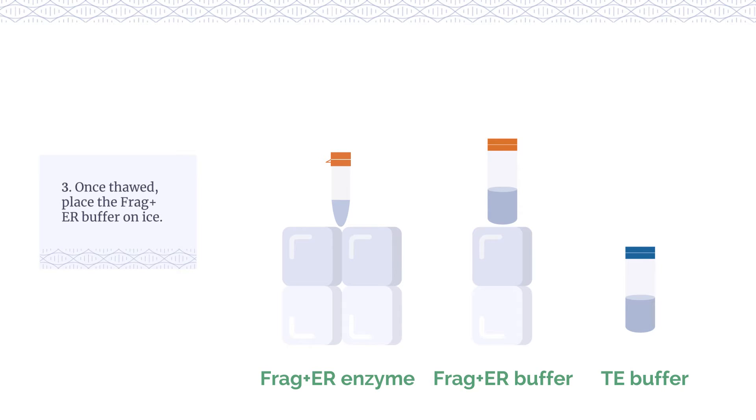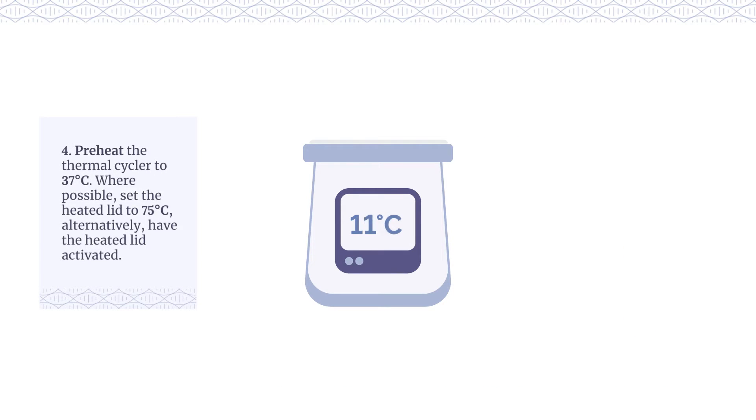Once thawed, place the Frag Plus ER buffer on ice. Preheat the thermal cycler to 37 degrees centigrade. Where possible, set the heated lid to 75 degrees centigrade.